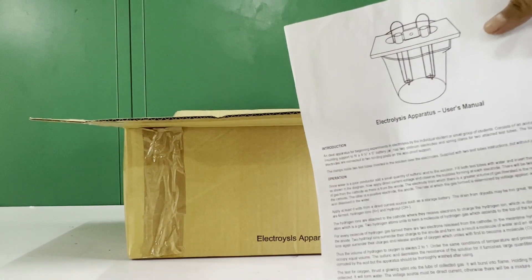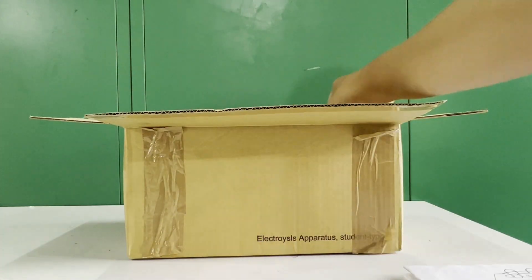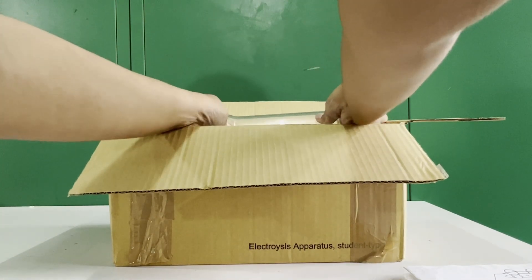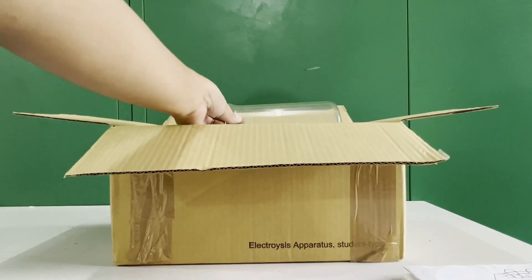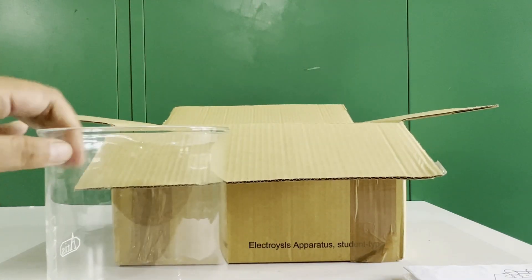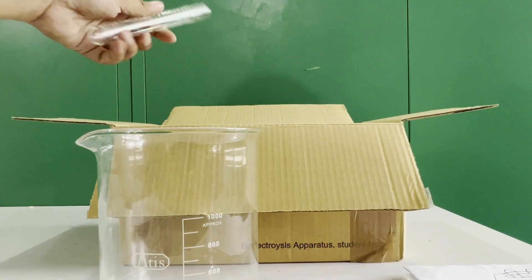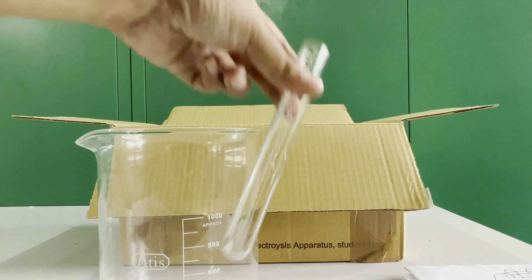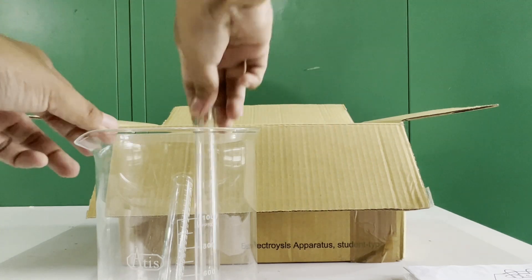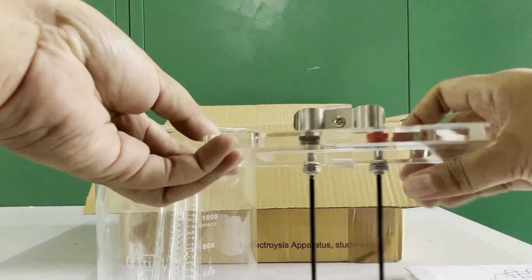To perform our electrolysis experiment, I will be using the electrolysis apparatus provided to us by DEPED. It includes a large beaker, two test tubes, and a glass portion containing the electrodes.